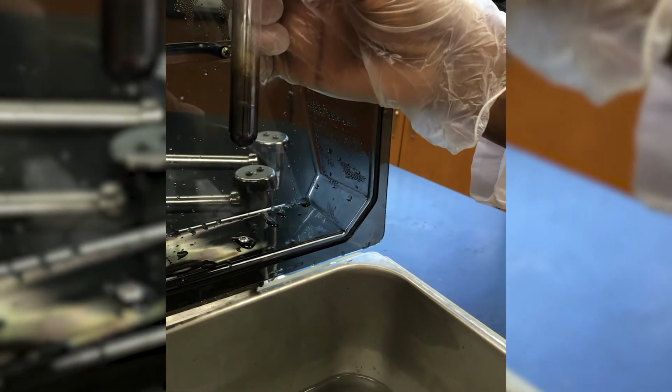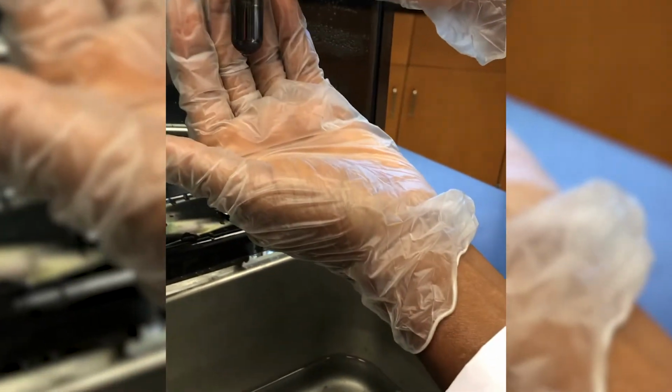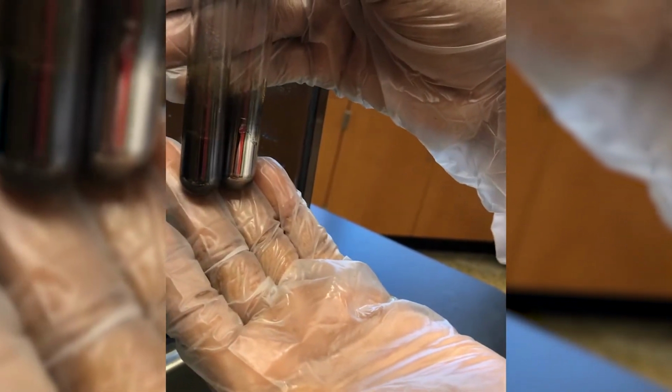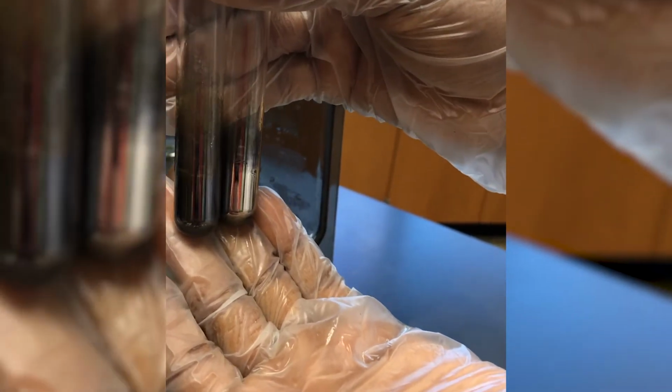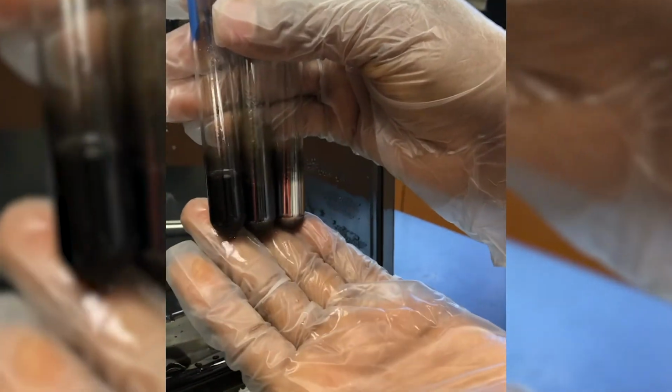So this is what it looks like. The positive test is supposed to be a silver mirror test. You can actually see the silver mirror. And this is what our unknown looks like. This is unknown Z in our Tollens reagent. If you have an aldehyde, you will see a silver mirror. If you have a ketone, there will be no silver mirror.